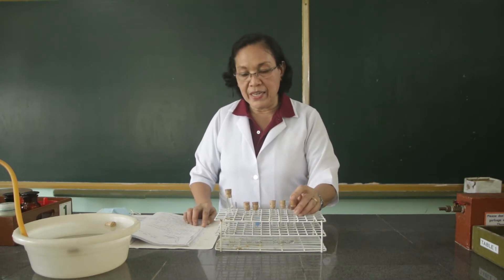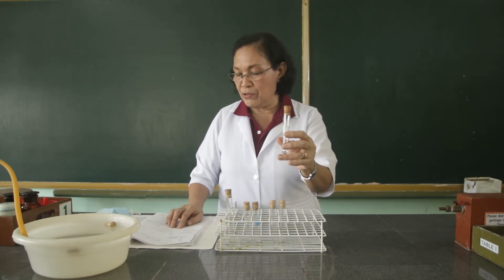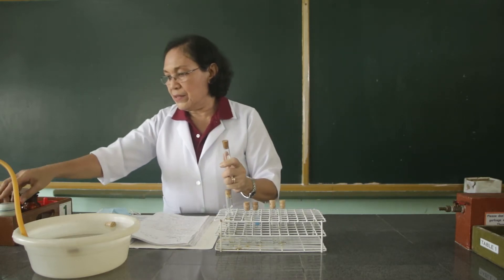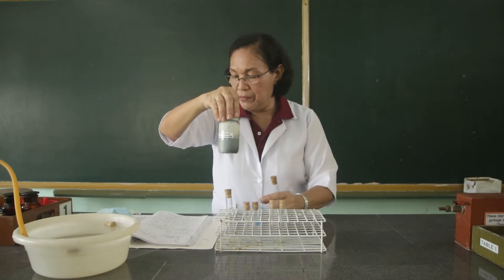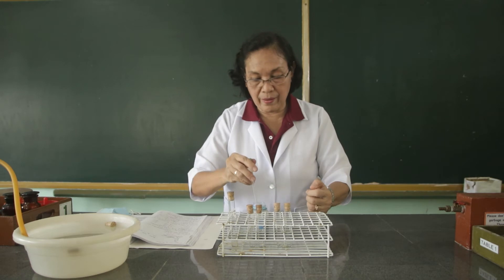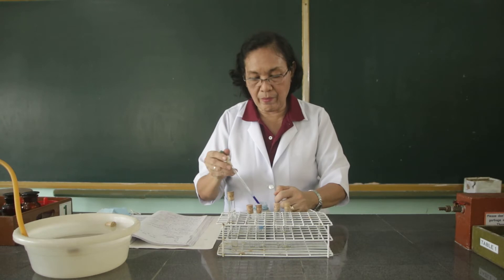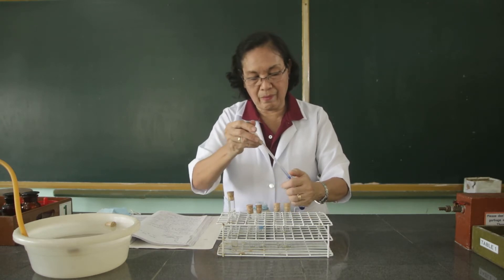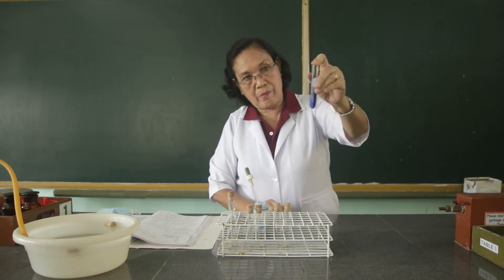With one of the acetylene gas test tubes, we are going to add 5 ml of ammoniacal solution of cuprous chloride. This is the cuprous chloride, and we are going to add 5 ml to the acetylene gas. Observe what happens.